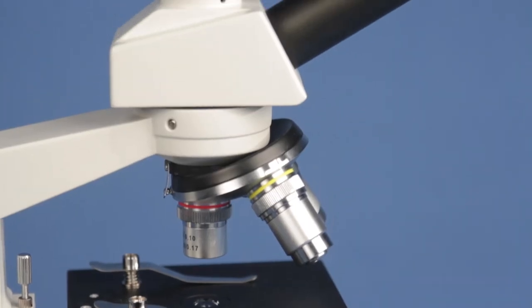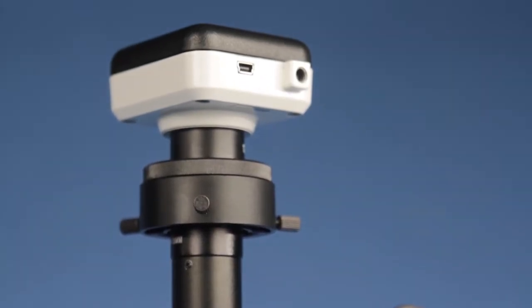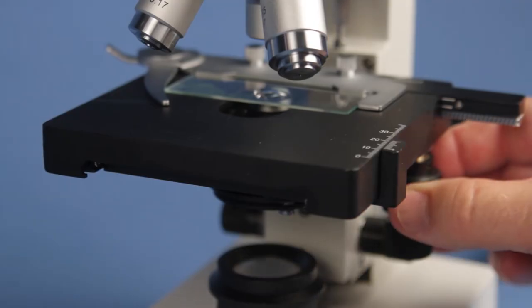The teaching head allows teacher and student the ability to view a specimen at the same time and gives a second eyepiece for easily mounting a USB camera.